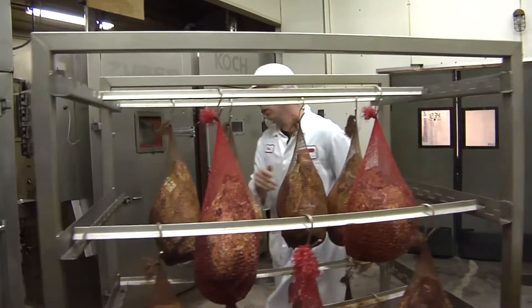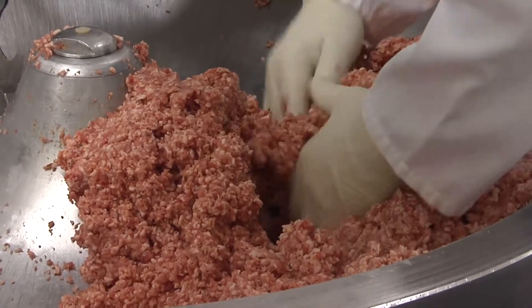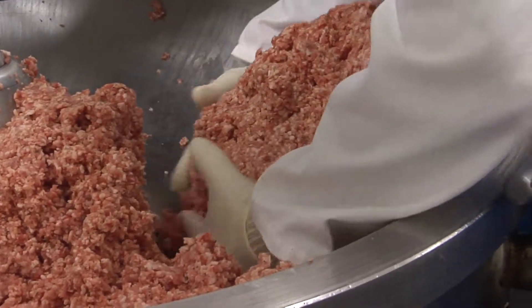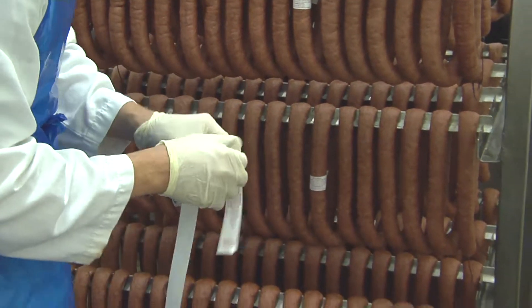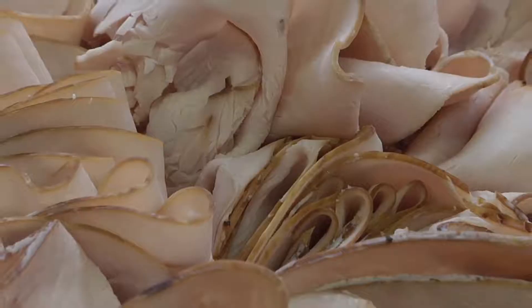A critical part of producing safe food is ensuring that the plant environment is maintained in a way that will not contribute microbiological contamination to the finished product.